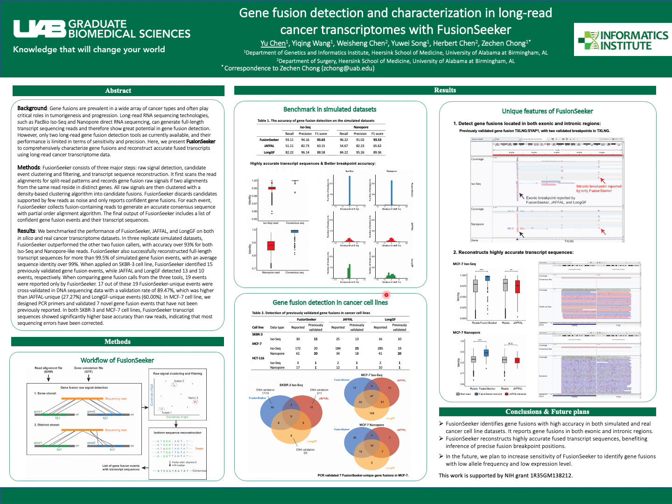And here we further benchmarked the breakpoint accuracy for the 3 tools, and we see that on the top for the FusionSeeker's result, we have a very high peak in the middle at 0, which means most of the events are reported with exact breakpoint locations. And for the remaining tools, we don't see that peak, which means they have worse breakpoint accuracy than FusionSeeker.